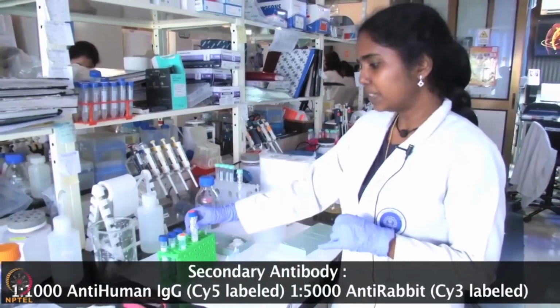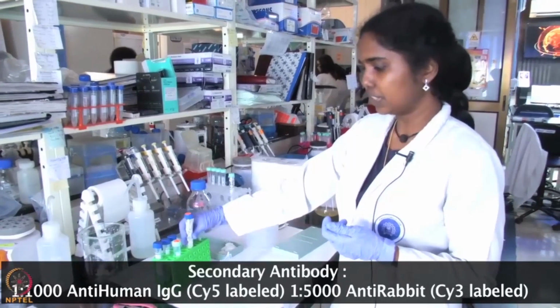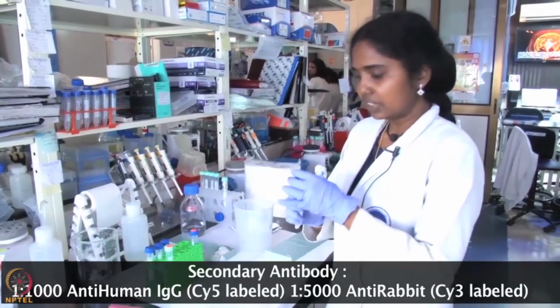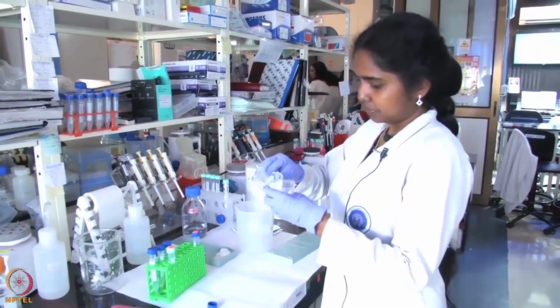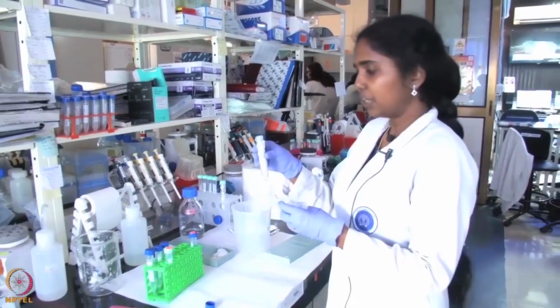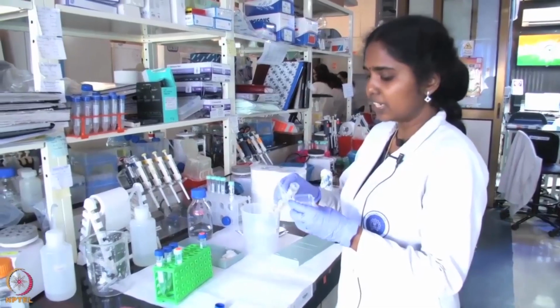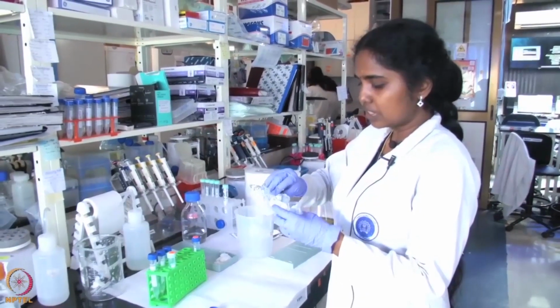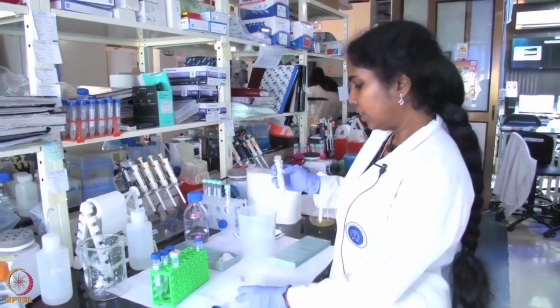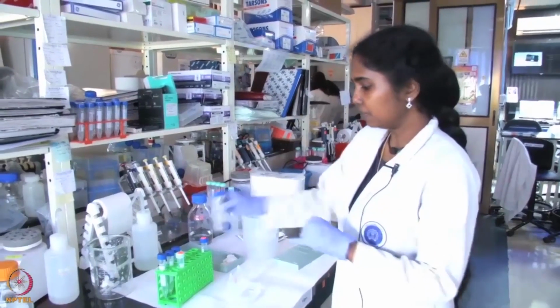And this step is very cautious because the secondary antibodies are labeled with fluorescent dye. So you have to do it in the dark or cover it with foil. So this is the secondary antibody. It is a mixture of 1 in 1000 dilution of anti-human IgG, which is Cy5 labeled, and 1 in 5000 dilution of anti-rabbit antibody, which is Cy3 labeled.